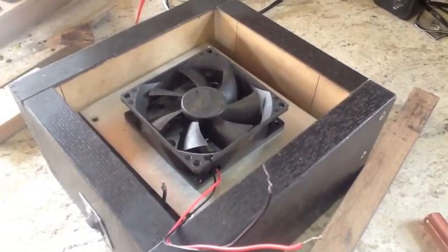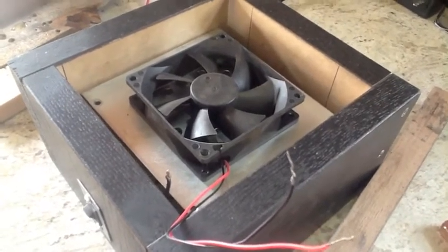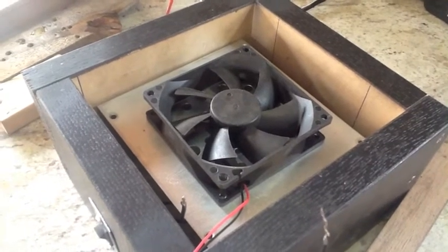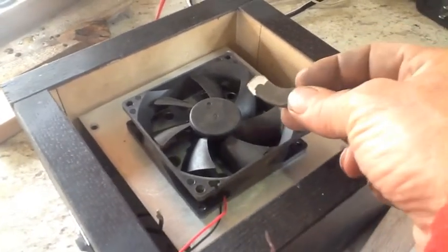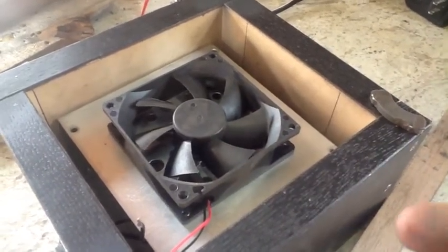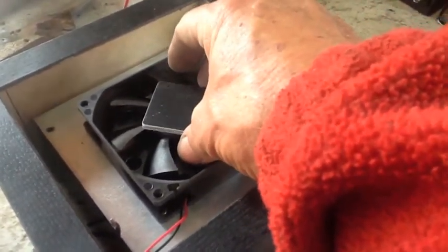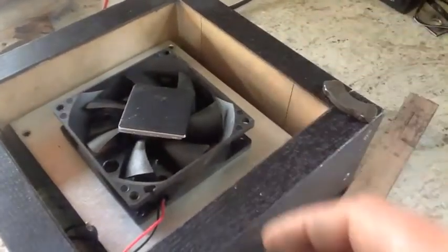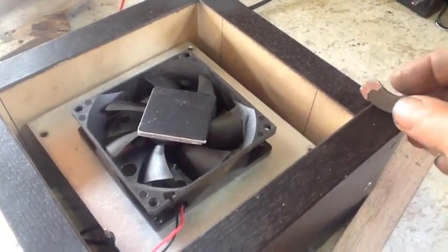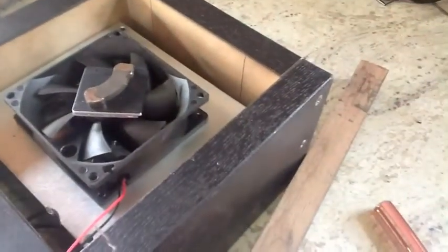This steel platform brought the fan up to within just about one-eighth of exactly where it needs to be vertically. In order to get this magnet as close to the glass as possible, the only thing I need to do is drop these two shims. These are aluminum, and I'm going to go ahead and secure them down on top of the fan, and then put my magnet on top.